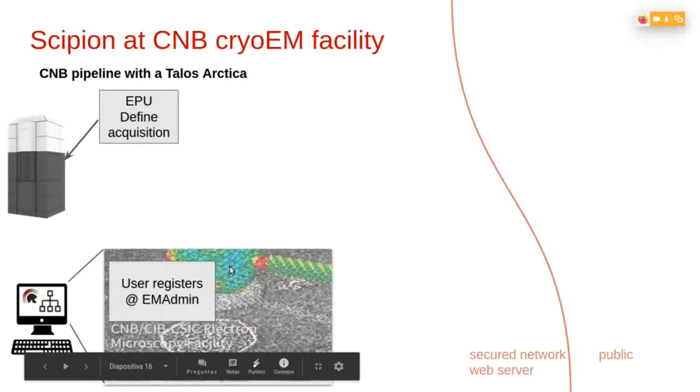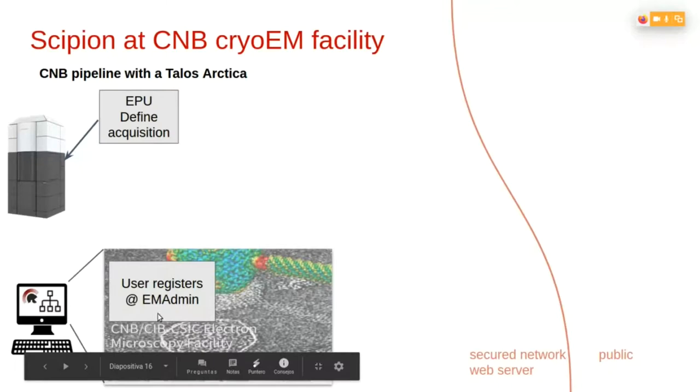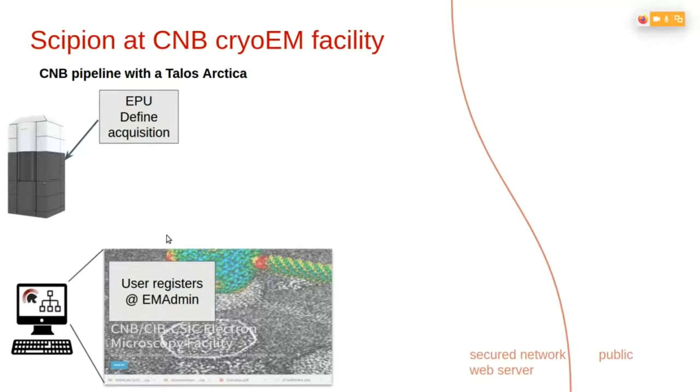Well, just to go into a bit more detail on this pipeline that we have in the CNB for the Talos microscope, the users register themselves or are registered in the EMAdmin, and EMAdmin schedules a slot of time for the acquisition. And when they arrive, the facility manager defines the acquisition by getting it in focus or acquiring the gain. But when the acquisition is ready, then the acquisition starts and the movies are being generated.